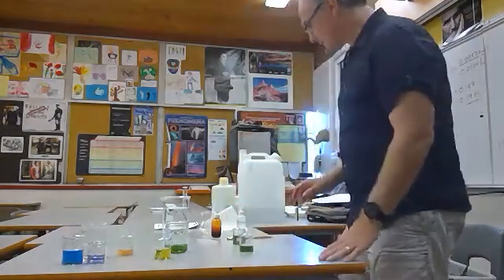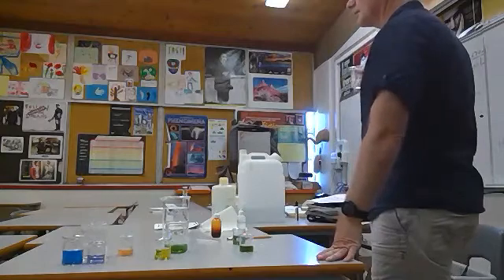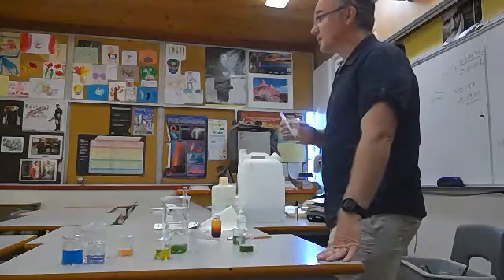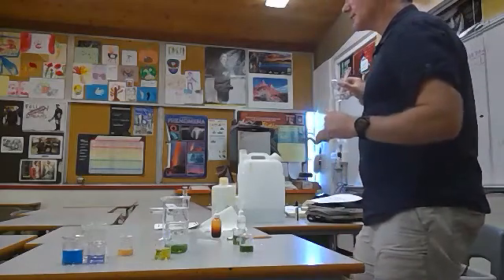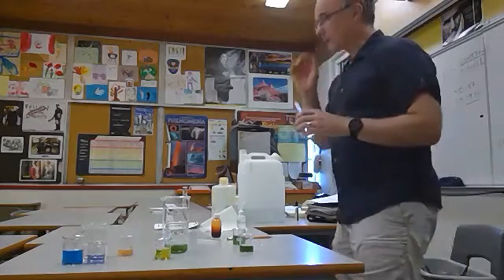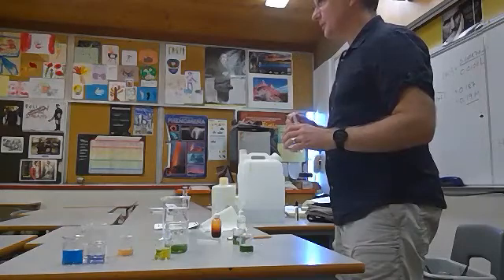Now, this acid is the one we use in the titration, and that's about a 0.2 molar solution. And that's really concentrated. I would not want to drink this, right? If I take the negative log of that number, it's around 1, so it's about pH 1 roughly. I'm thinking that's quite dangerous. It's way more dangerous than my stomach acid. But it should cause a drastic change in pH if I add this to a beaker.